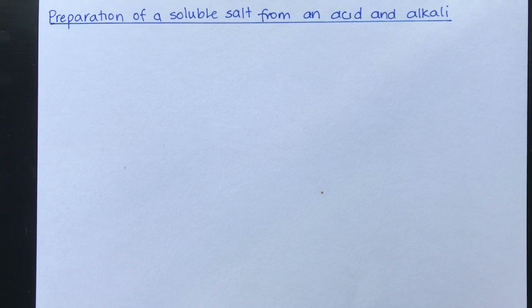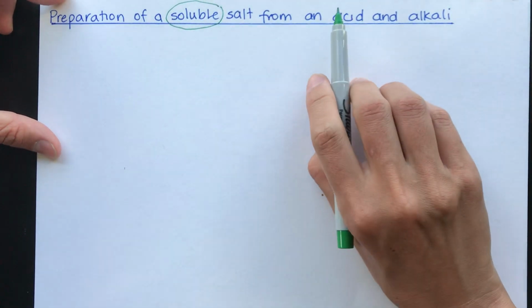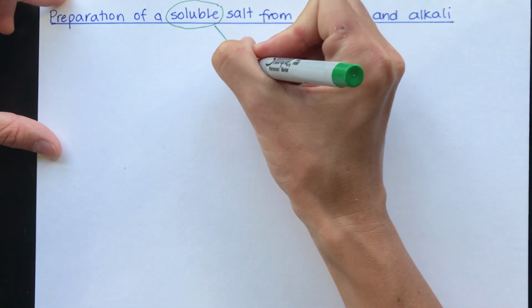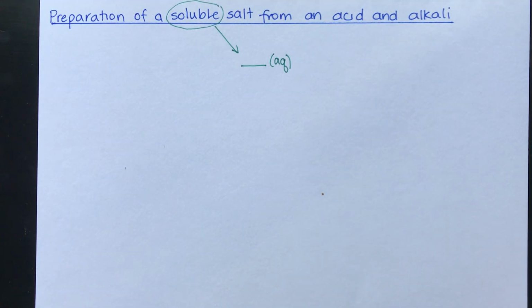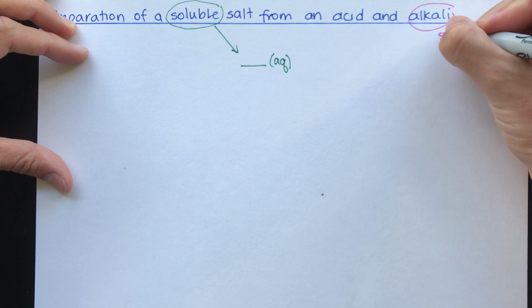Okay, hi folks. This is the third and final salt prep video. And in this one, we're going to do how to make a soluble salt, again, but this time from an acid and an alkali. So, soluble tells you, just like the last video, that your salt is going to be aqueous. And we're going to make it from an acid, but this time, we're also going to make it from an alkali.